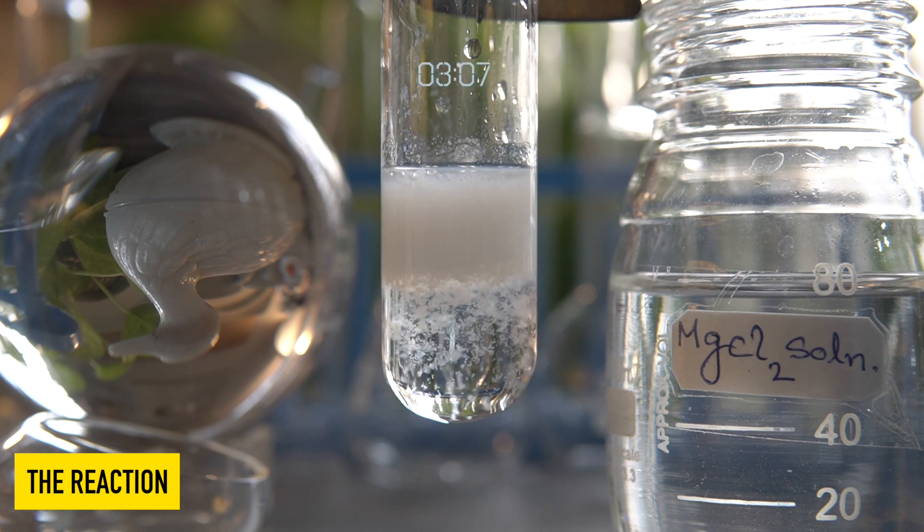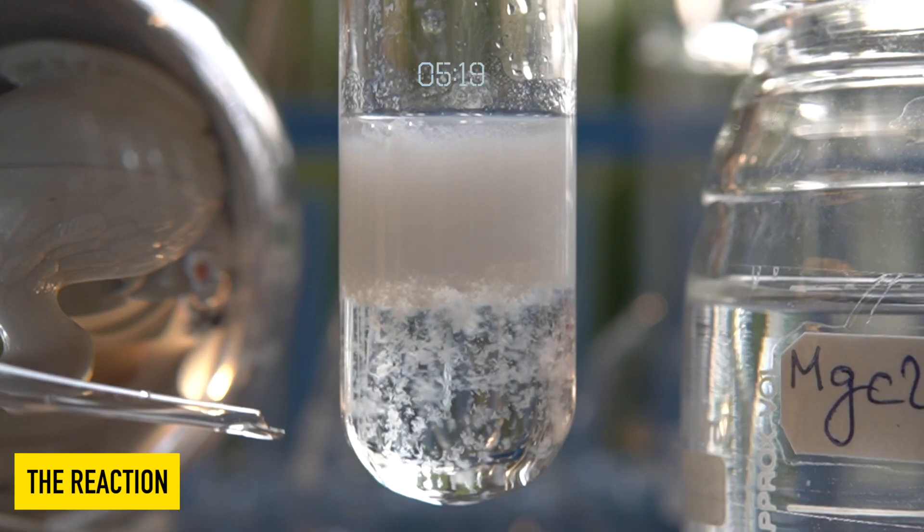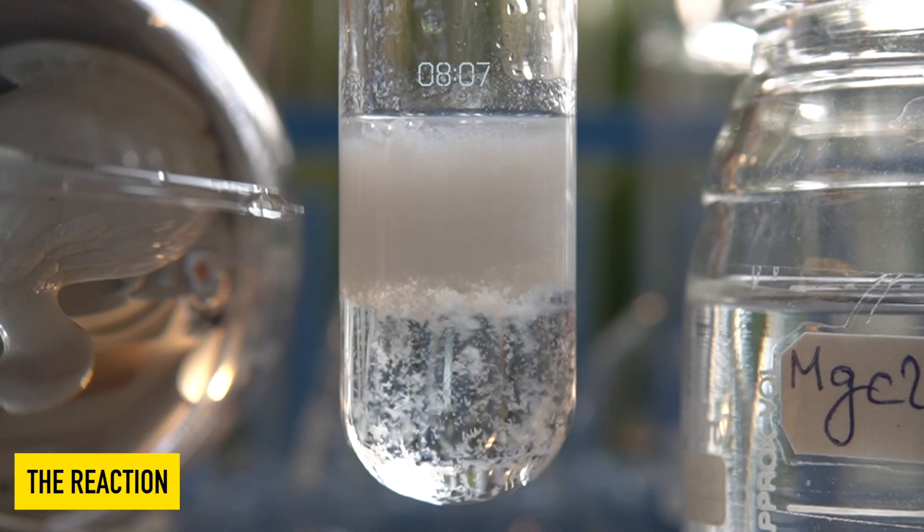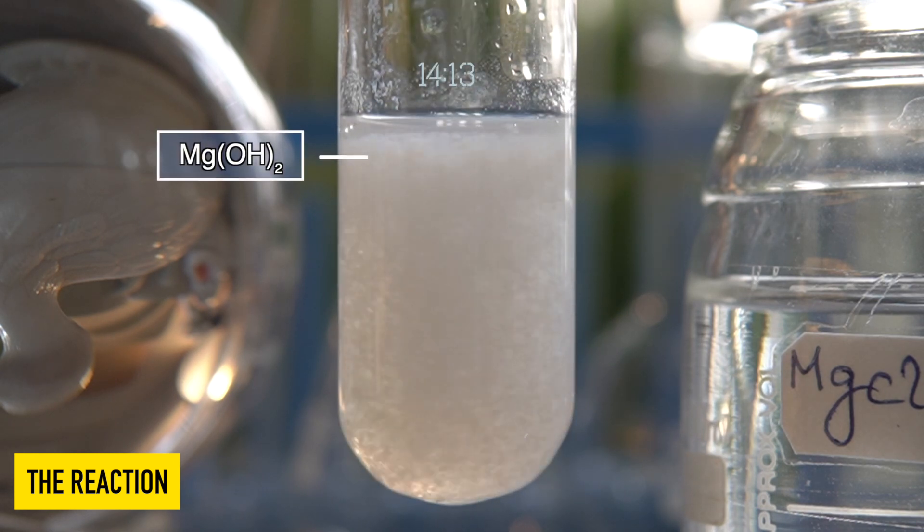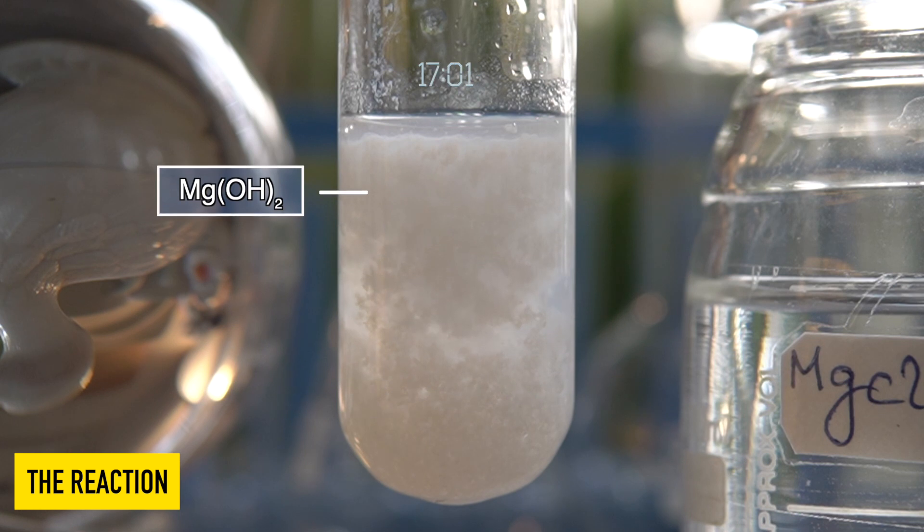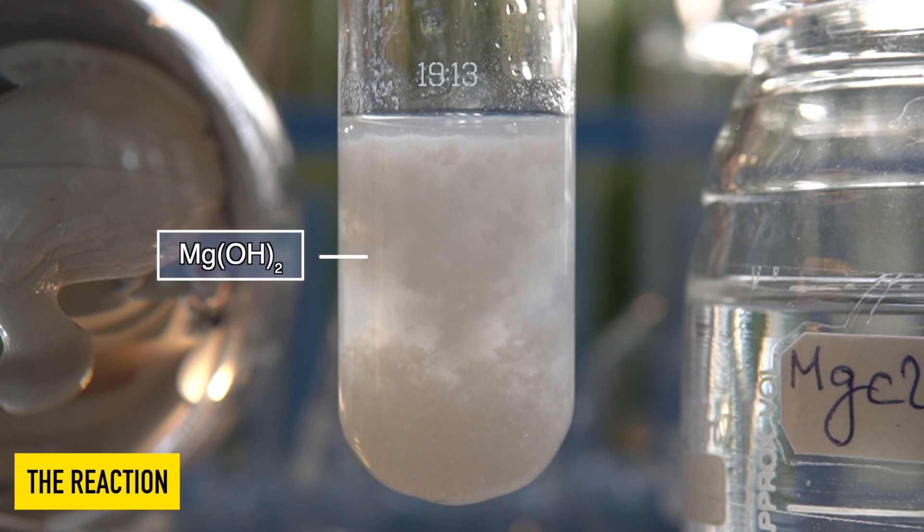The insoluble white precipitate that has been formed at the bottom of the test tube is nothing but magnesium hydroxide. This beautiful precipitation reaction is a good example of a double displacement reaction.